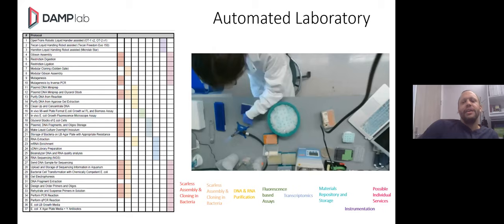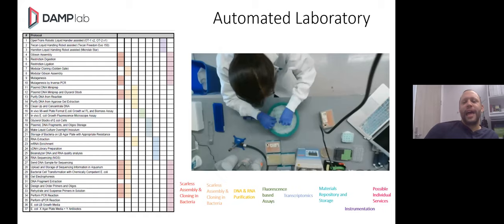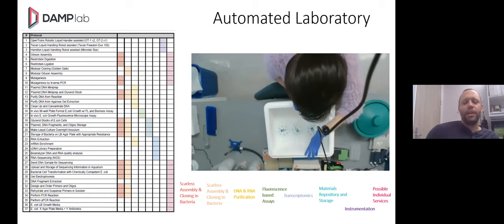And then this is an image, right? This is kind of localized for the camera, but you could imagine this is one of our laboratory technicians. I think this is Rita. The idea would be you'd actually watch her moving around the lab. And if you did a time-lapse video, which we don't have zoomed out enough, you'd see her moving in the same track. It would look like she's moving like a robot along the same place because we have everything in a standardized location. And we're trying to make it so that person looks a lot like that McDonald's assembly line so that as new people come in on a regular basis, it's very interchangeable and robust.